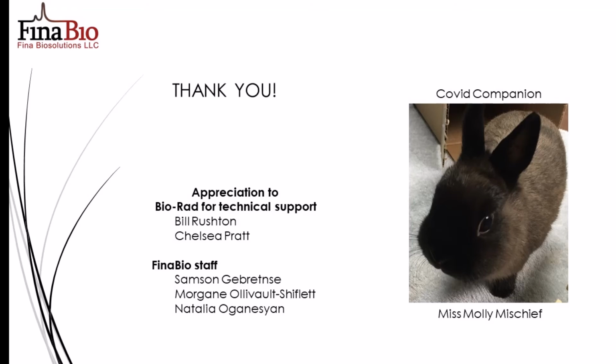In the cartoon pictures, they often show pores as sort of these uniform holes going through the beads, but in fact, they're fairly tortuous, and many of them, in older resins especially, more or less dead end. They narrow and then they dead end. So the Nuvia resins have pores that have been more optimized, so there's actually more useful surface area that's available for binding. And I think that's the reason why the capacity is higher.